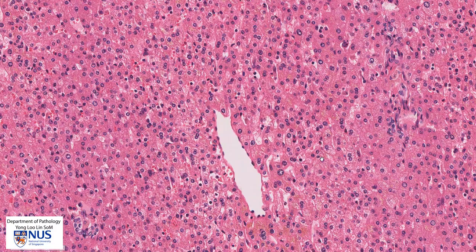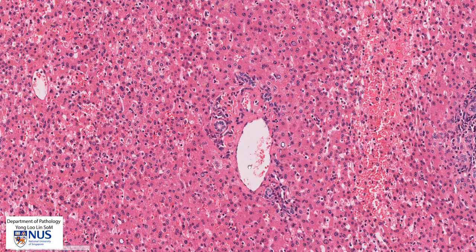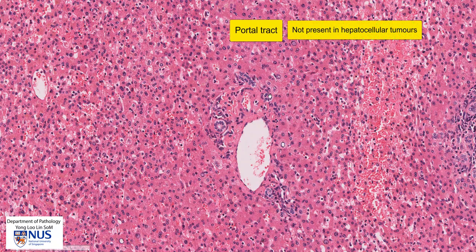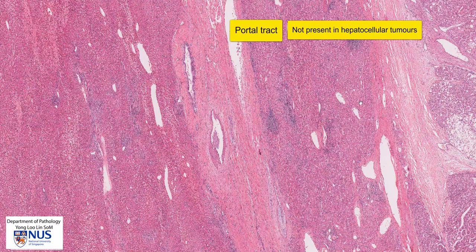The NC ratios are fairly low. Here we can appreciate a portal tract where there is the portal vein, the artery, and small bile ducts. We will see portal tracts within non-neoplastic liver, whereas we will not find portal tracts in liver cancer or liver tumors. Let's move over to the area of the tumor.